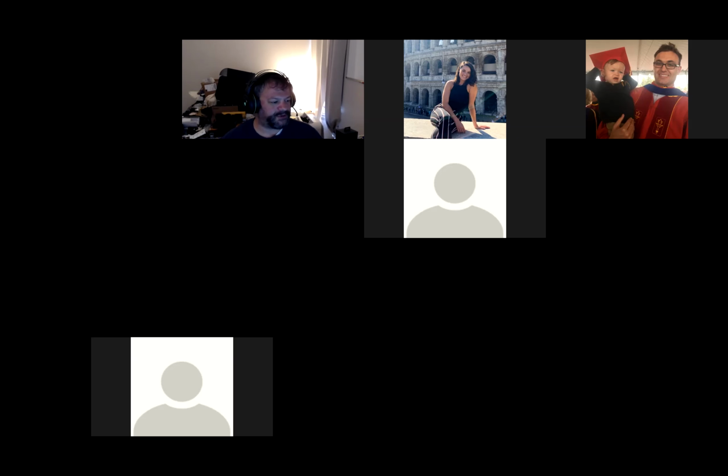And actually, Sarah ended up doing everybody a huge favor because I can pretty much guarantee that at least one or two people in the class would probably run into this problem at some point in the future. And we all actually, including myself, learned that this thing doesn't work very well if you have a virtual environment activated.